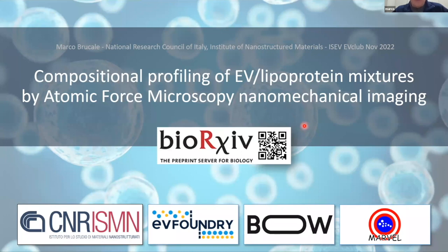And the title really says it all, I think. In the paper, we explain how it's possible to use AFM microscopy to get a glimpse about the compositional content of complex mixtures in samples containing both EVs and lipoproteins by means of imaging and nanomechanics.